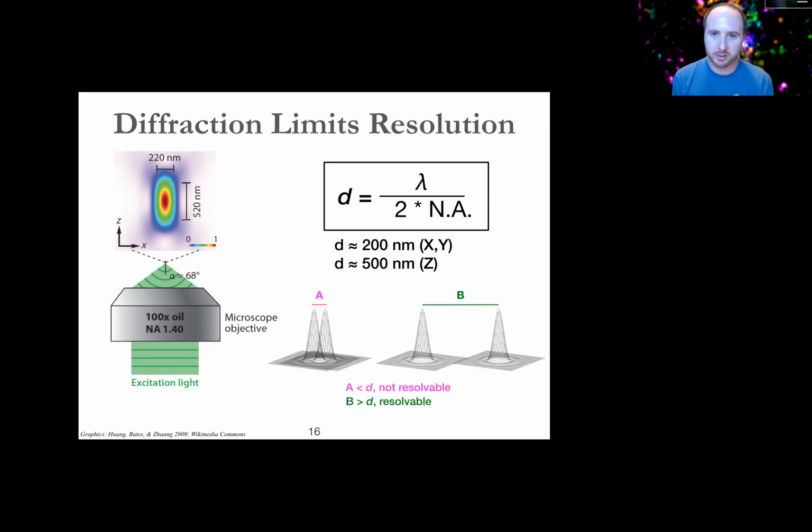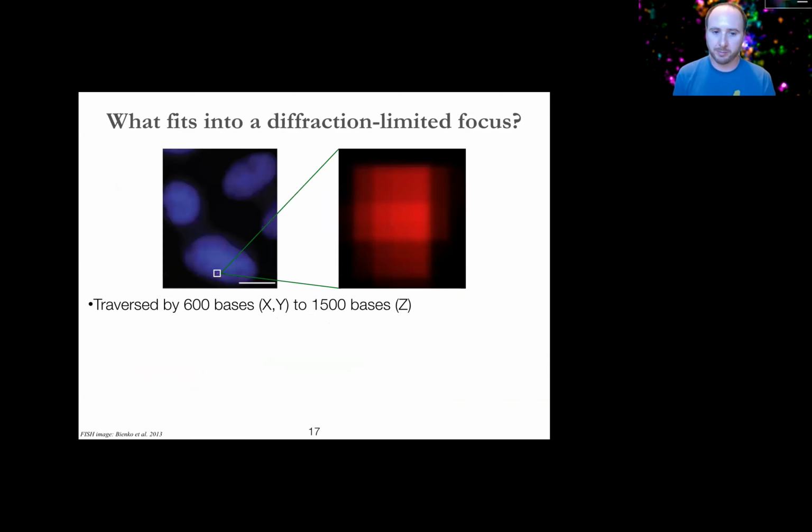And I think the way that this concept is often introduced is this idea of two objects being close to one another and whether or not they're resolvable. And that's a very useful way to anchor understanding around this topic. But there's also, I think, another more practical way to think about it that I like to introduce, which is just thinking about volumetrically, what does this mean? So for instance, if I do FISH targeting on genomic DNA, targeting a very small region, because of diffraction, we know that there's going to be a characteristic minimum size of what I see on the microscope. My signal can only get so fine before it essentially becomes the same size.